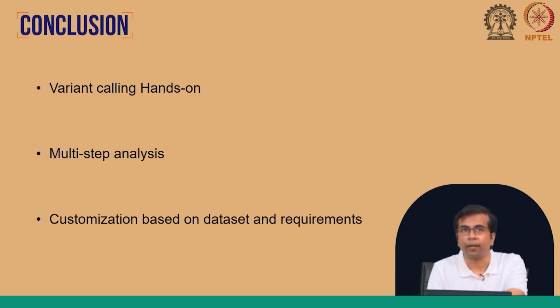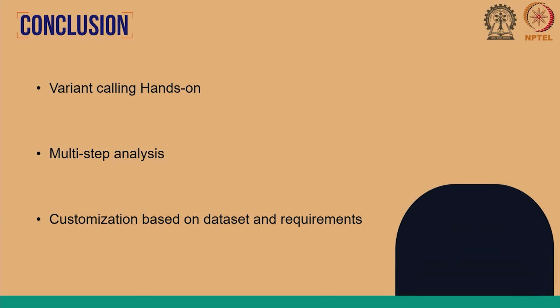So, we have learned how to do the variant calling ourselves, and we have seen this is a really multi-step analysis, and of course, within a very short period of time it is not possible to show all the steps, all the options that are available, and we can also customize these options based on data sets and requirements. Thank you.